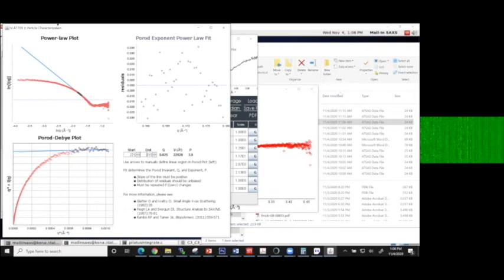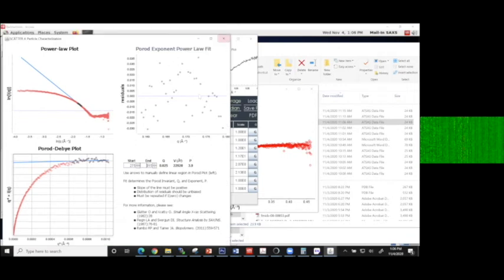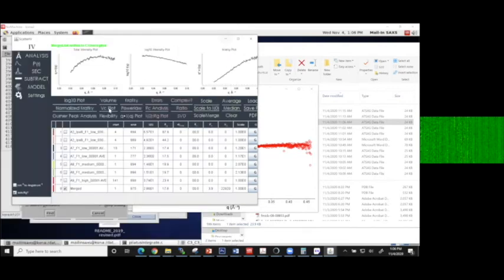So I have my volume. That's good. Step number 2 is to click a button here, this VC plot thing. This VC plot thing does a calculation, integrates that curve up until that region I just found with that slope finding tool. So I just click that. It does an integral, uses the radius of gyration and that volume to come up with a mass. So now I can figure out what the mass is.